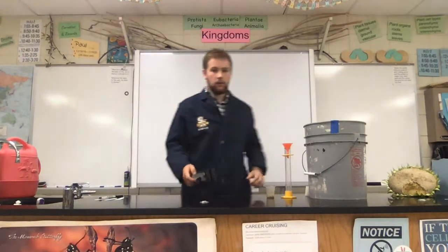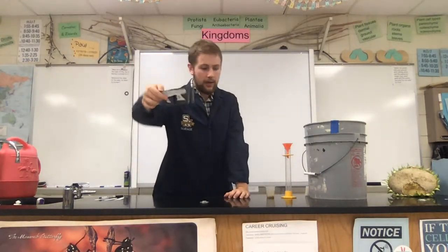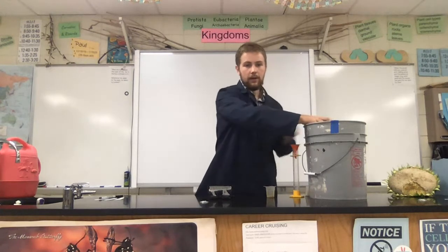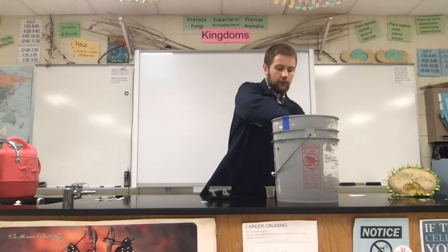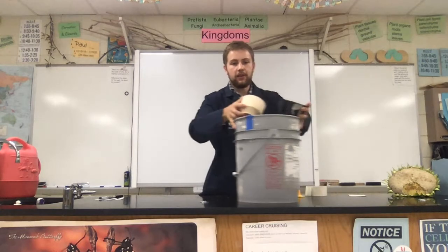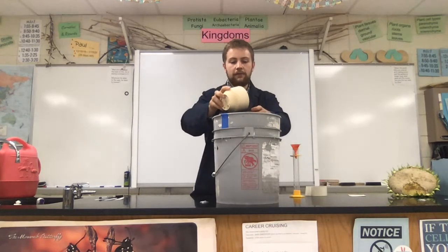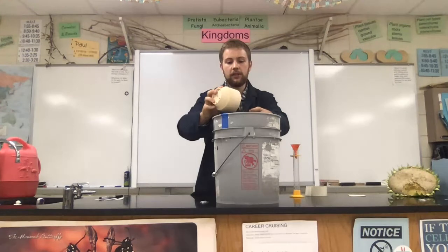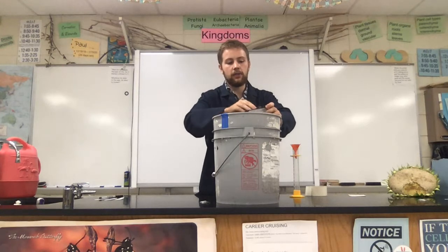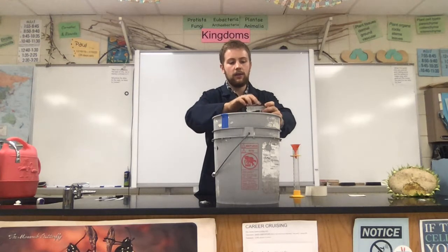All right. So I've got this planter, 4 quadrants. Now I need to go ahead and add some soil. So I'm going to go in this bucket and scoop it out. Hopefully I don't make too big of a mess, but I'm just going to scoop it out and fill each of these quadrants about 3/4 full. I'm overflowing right now, and I'll bring this over and show you in a second what this looks like.